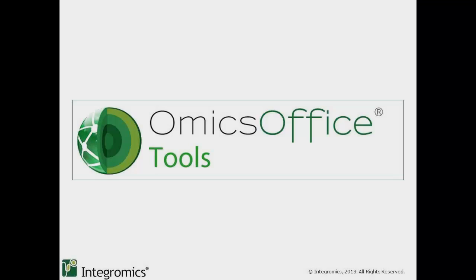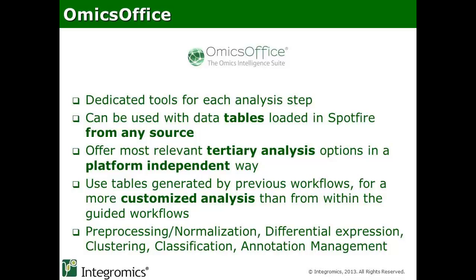As the analysis has been performed within the Spotfire platform, additional downstream analysis can easily be added to the results of the workflow using both the tools integrated in Spotfire and the specific tools for biological data analysis provided by OmicsOffice. These include all the statistical tools used during the different workflow analysis steps, as well as additional tools for data integration or functional analysis.